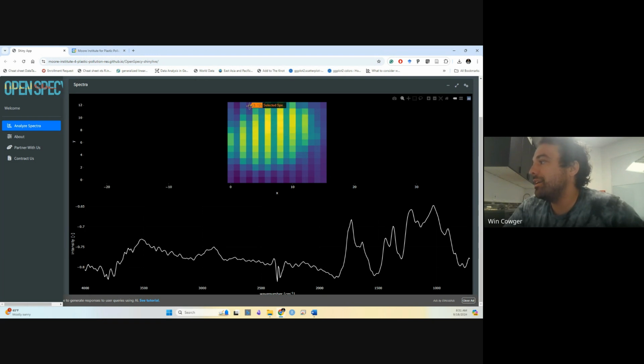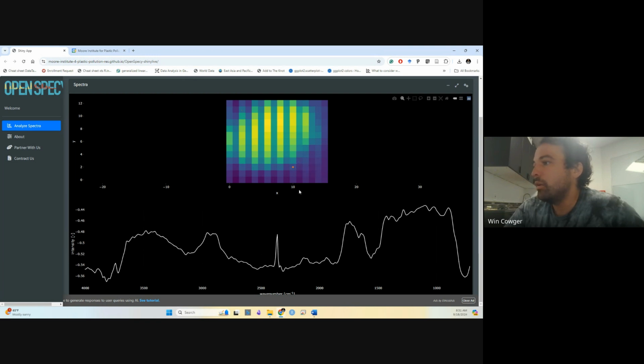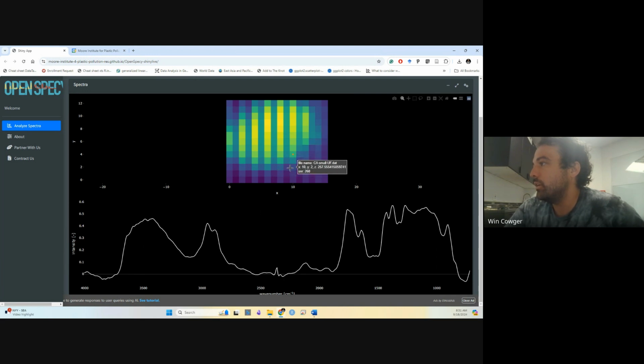But basically here, it's like, that's not really the particle anymore. Somewhere around 200, I'm not getting good signal. I don't like that. Over here, yeah, definitely starting to degrade the signal around 200. But then this is really clear particle signal around 400. So maybe 300 would be a good threshold to use here.